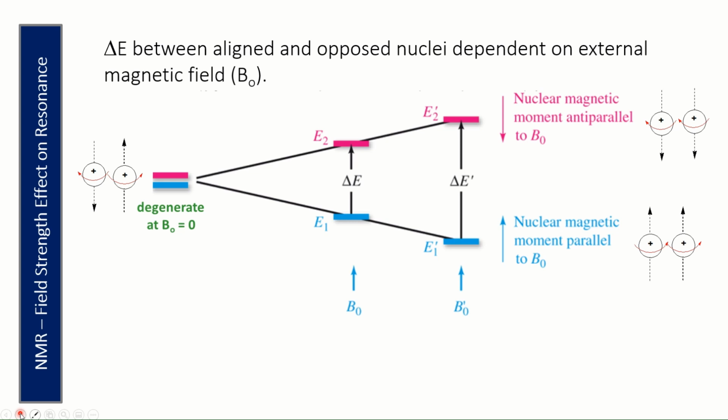From the degeneracy that we had earlier in the random sample, this creates an energy difference. You have to realize that that energy difference is due to a difference in spin, or reversal of spin.